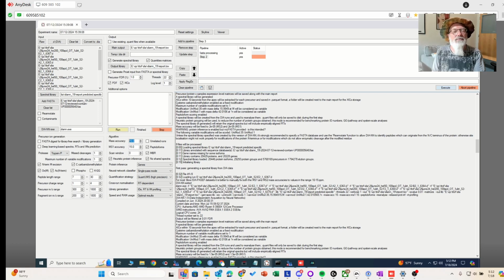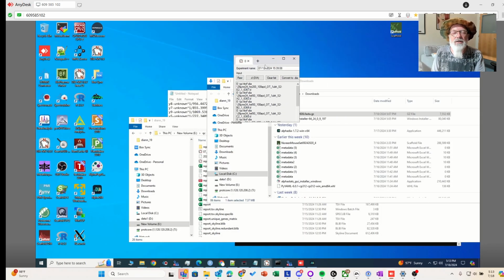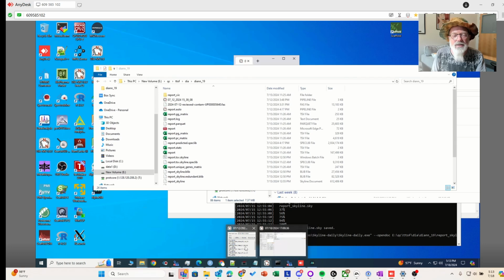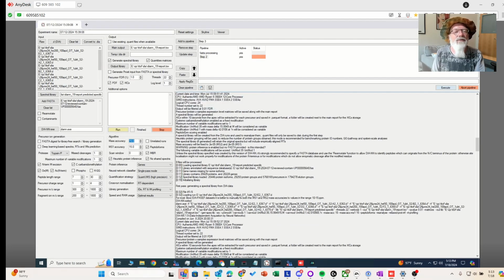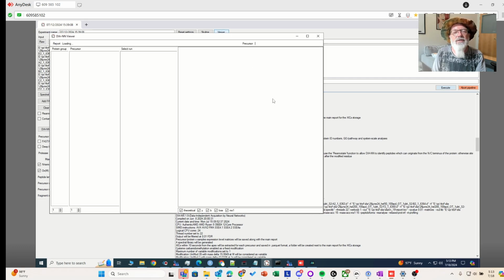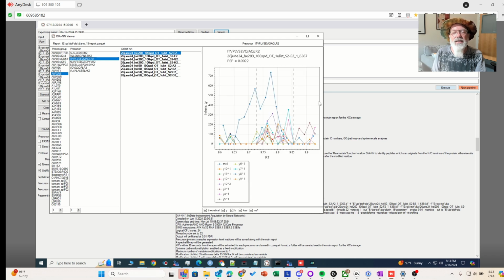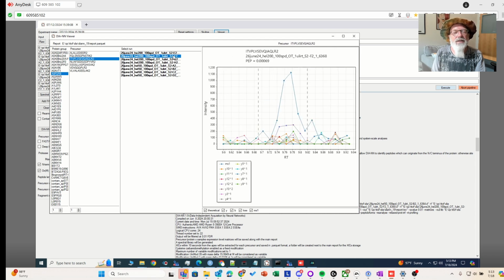Anyway, so let's look at the results. It'll run for another couple hours. I already did it. Here are the results. Okay, you'll see a bunch of, oh, let's look at the viewer first. Let's see if that actually worked. Okay, so if you want to see the viewer, once you're done, you hit viewer. This will not work unless you click that XICs, I believe. So you hit viewer. And then here's your proteins, here's your peptides, here's your files that they were identified in, which should be 8. And then you can see what the data looks like here.